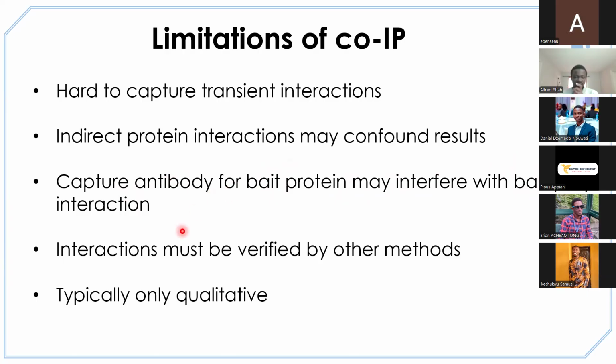Now, whatever you do, you should also confirm or verify the interaction using other methods. So we have BioID, you can perform BioID. Like I also mentioned, you can perform GST pull-down.